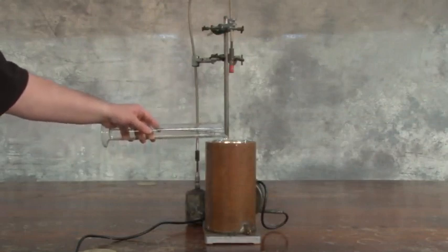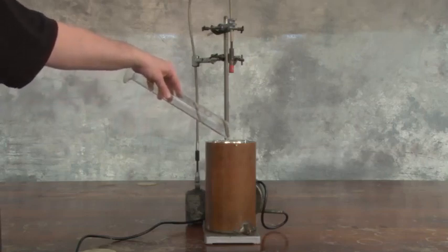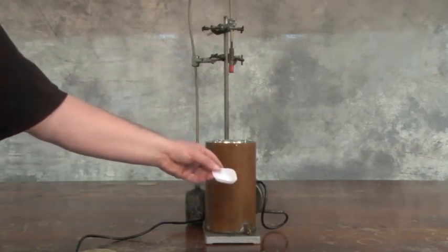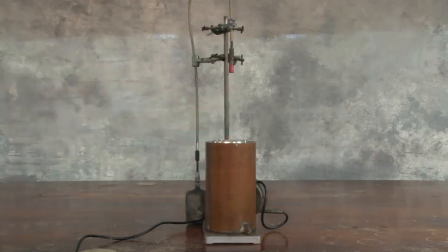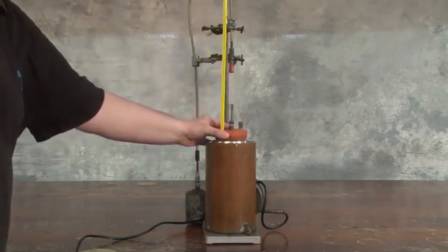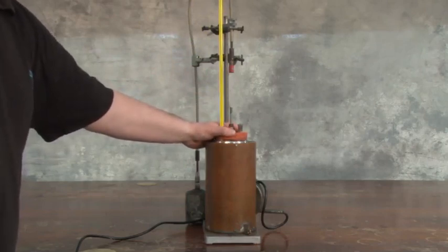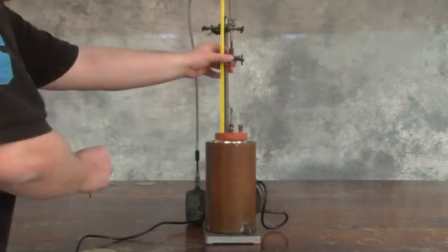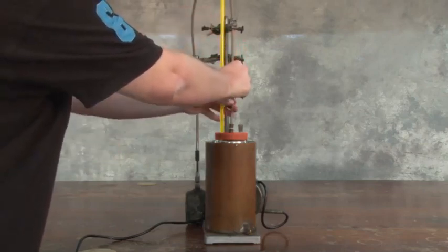Next, transfer 600 millilitres of distilled water to the calorimeter. And then add approximately 5 grams of sulfamic acid. Next, place the lid on the calorimeter, being careful not to damage the thermometer, and make sure the lid is tightly fitted. Then, attach the stirrer cable and tighten with an Allen key.